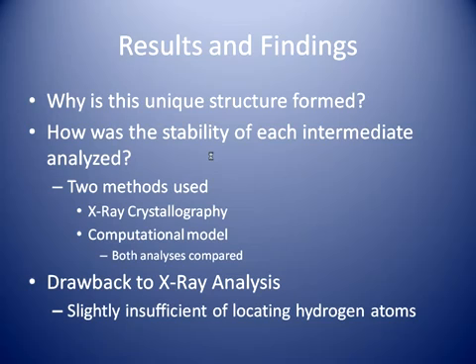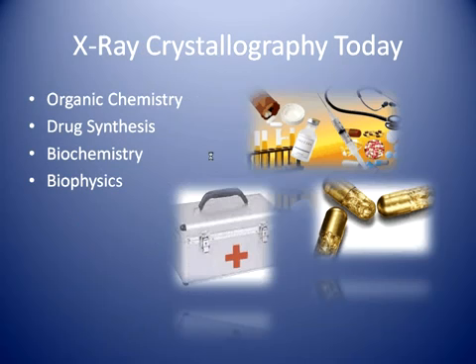As they were compared to each other, one thing to note about X-ray crystallography was that it has a drawback, which was that it was slightly insufficient at locating hydrogen atoms, which is always one drawback to X-ray crystallography. That's one thing that's actually being studied and trying to be improved.